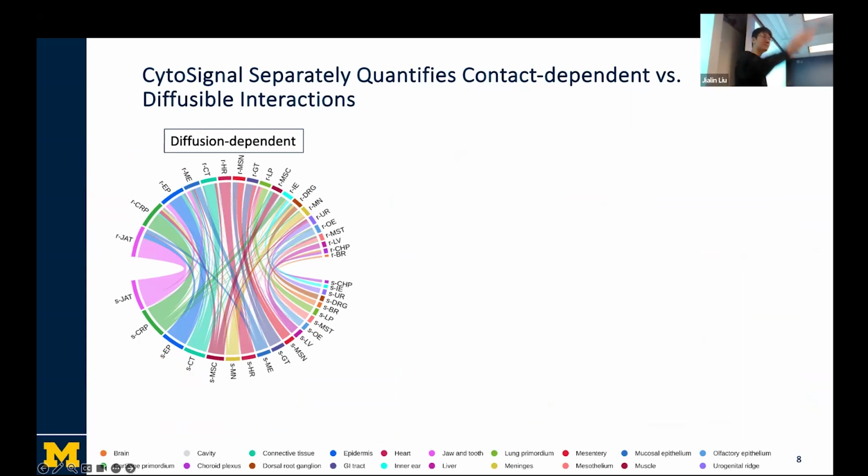I have a short question. You are aware of Visium HD, right? When applying CytoSignal to Visium HD, is there any difference, for example in size? There definitely will be a difference, because Visium HD gives you three resolutions: 2 micrometers, 8 micrometers, 16 micrometers. Below 10 micrometers is usually considered subcellular.